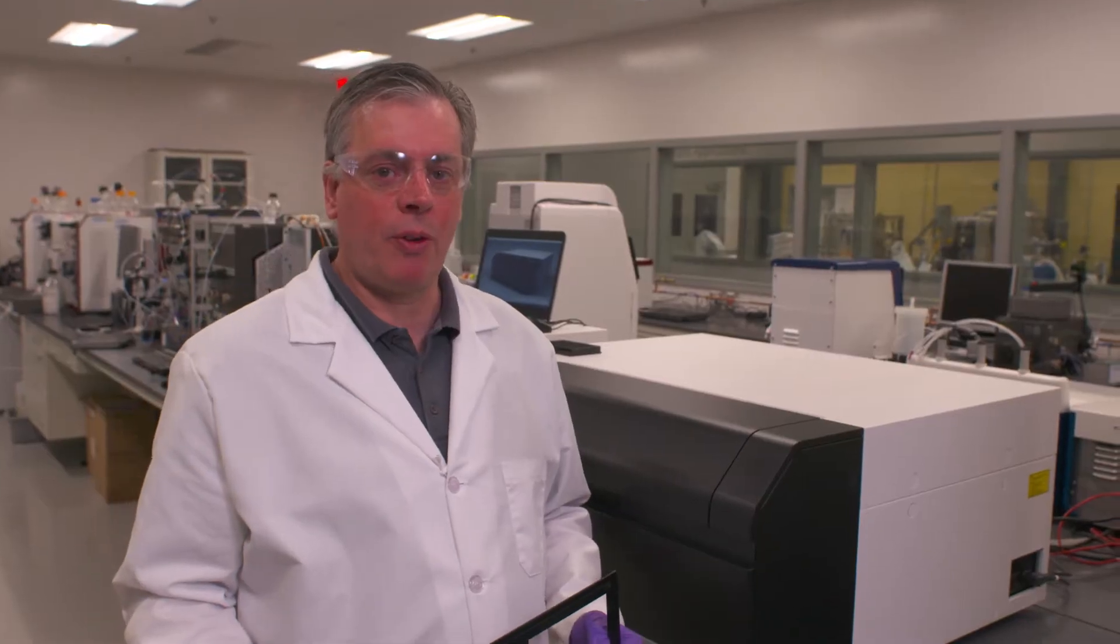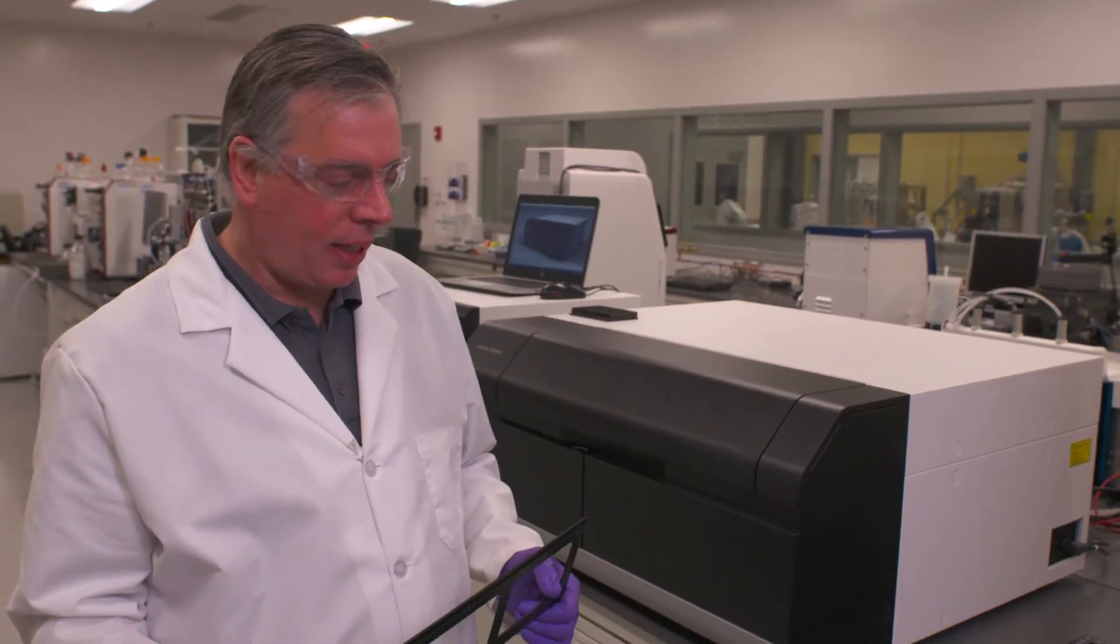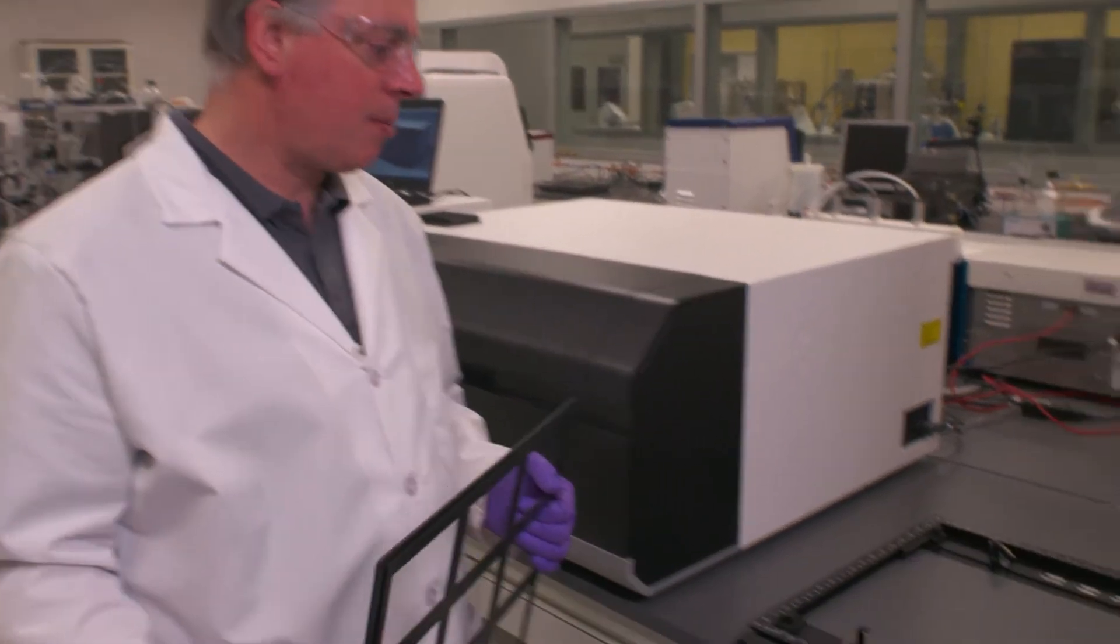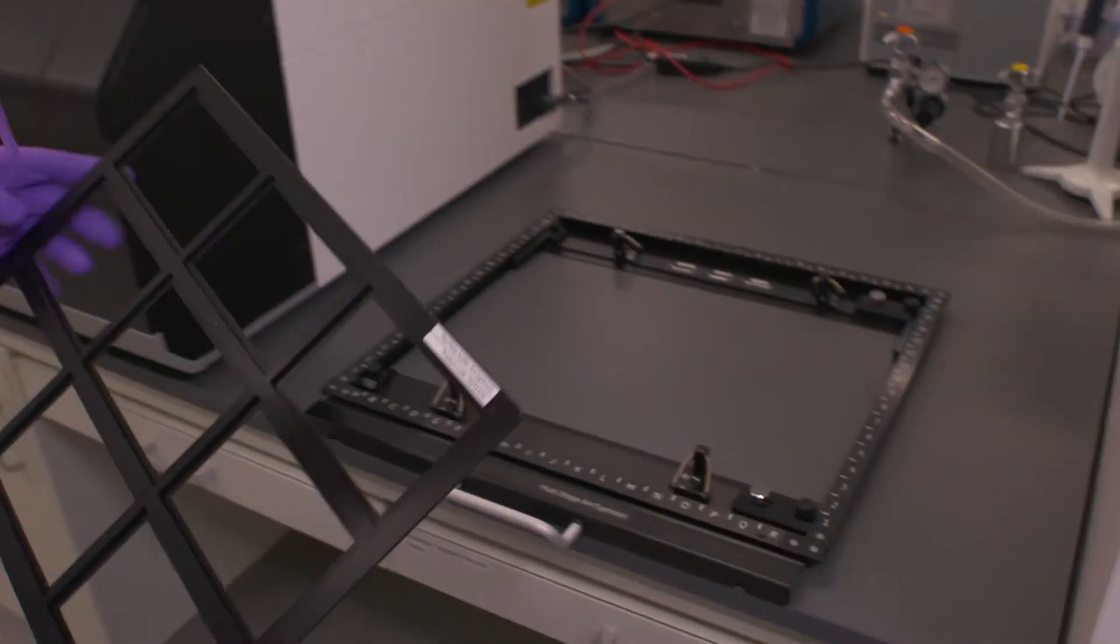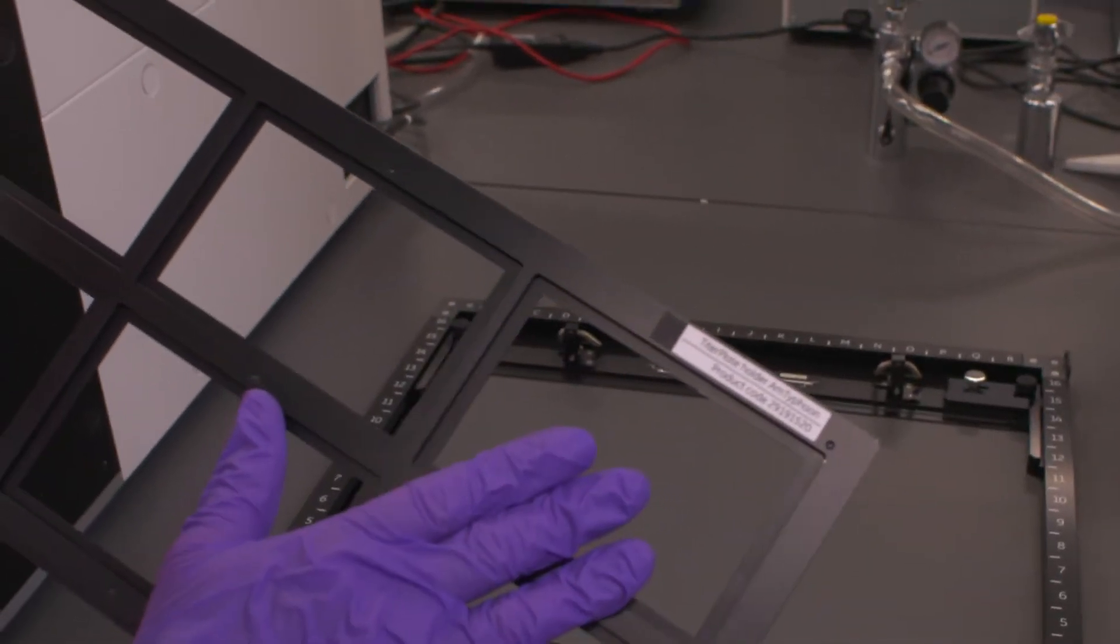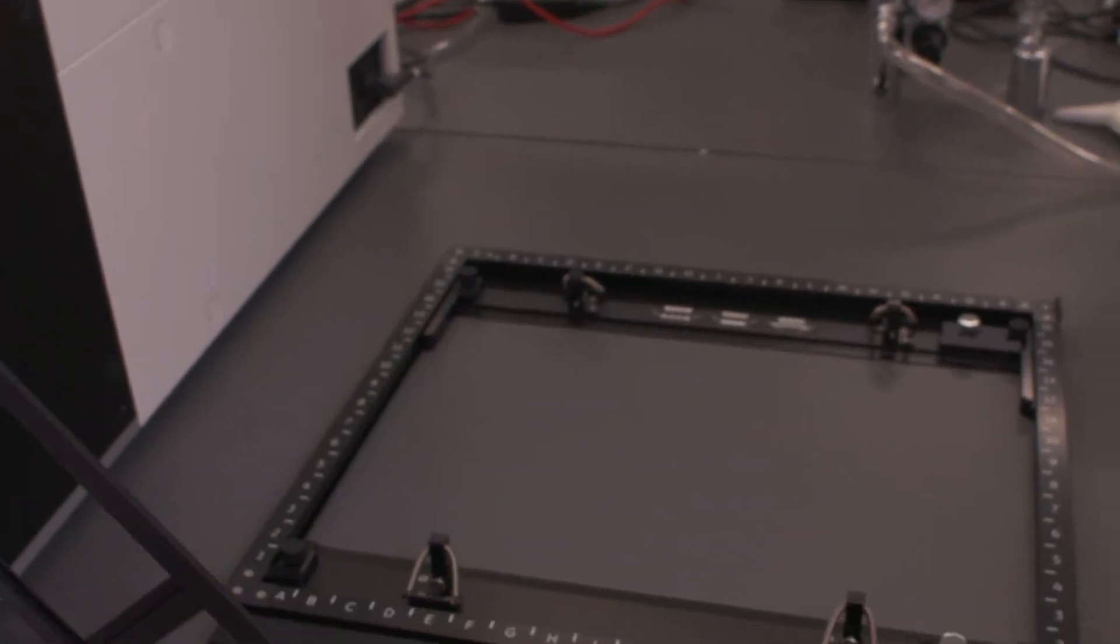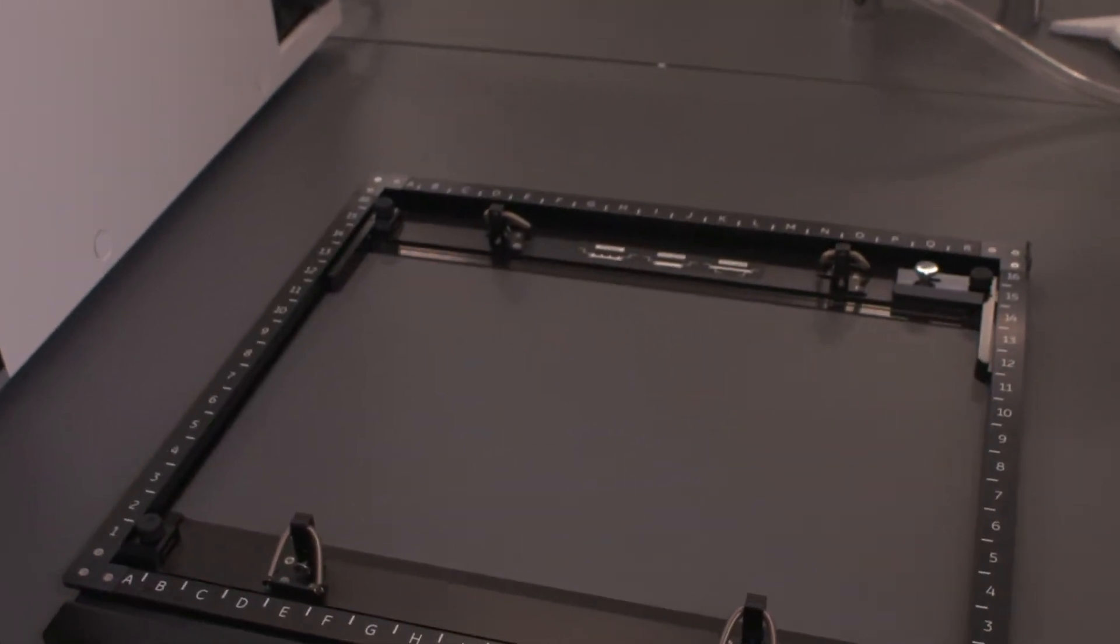In this session on the Amersham Typhoon, we're going to look at how we can place a micro-titer plate into the Amersham Typhoon to image it. We're going to need this accessory, the titer plate holder, in conjunction with the multi-stage.